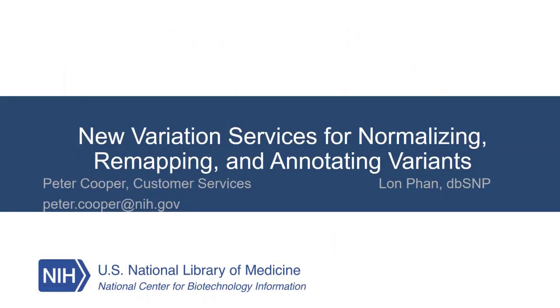Okay, so the full title of this webinar is New Variation Services for Normalizing, Remapping, and Annotating Variants.